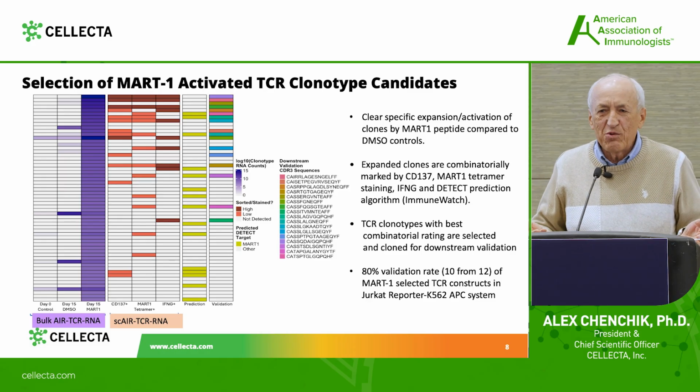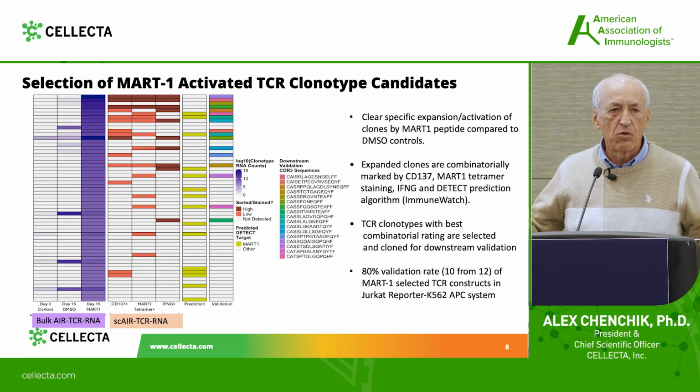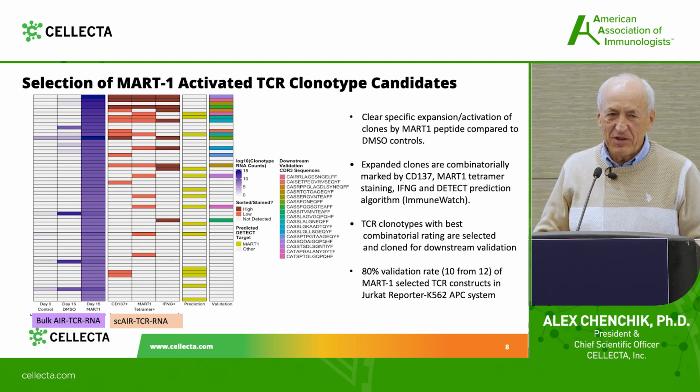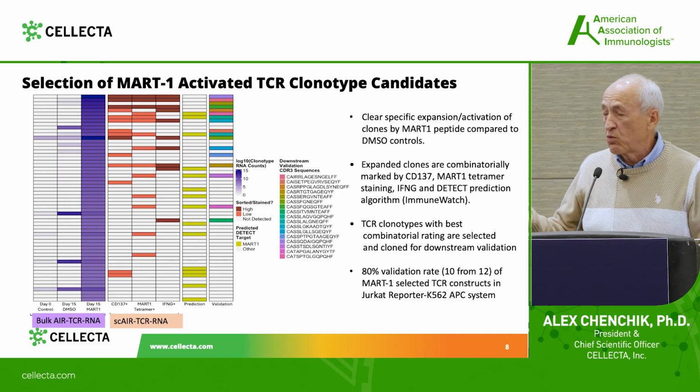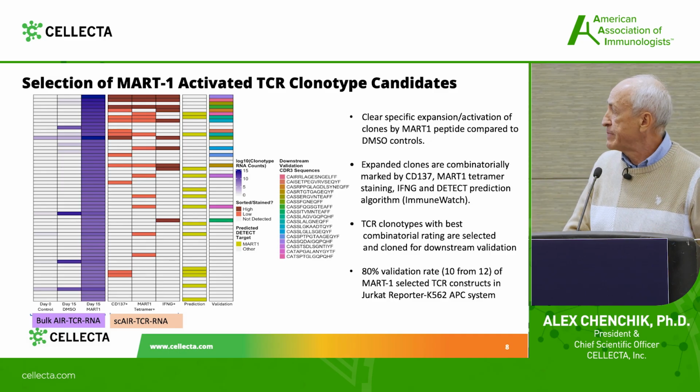From my point of view, if you don't want to do a very complicated experiment, it's already a good starting point, even without any follow-up validation experiments. You can choose the clonotypes which look several thousand-fold amplified after 2 weeks and just validate them to see what they recognize.